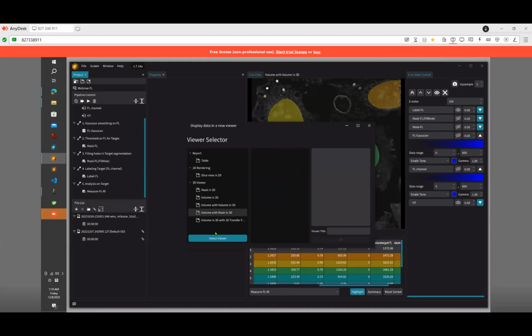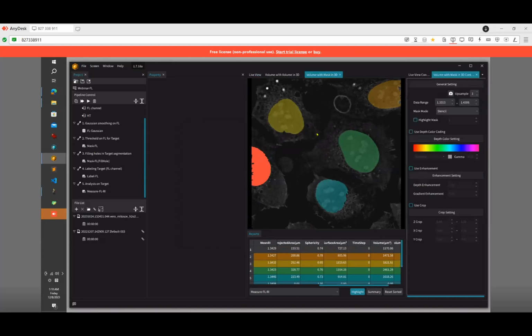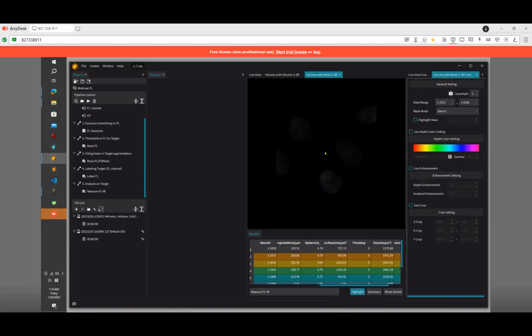So here, you choose the data set and you choose the label and make it visualized, which comes like this. Oh yeah, and my screen is very dark, but you can see the image will rotate. I would like to change the contrast here, yet it's not automatically controlled. Oh, too bright.